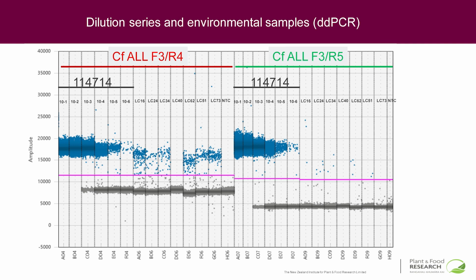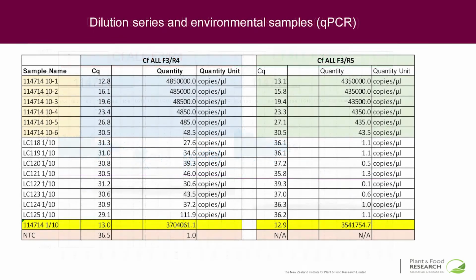But certainly on the second assay, it's good. Now, with this system, of course, we can actually quantify that. So what we're saying here is that we can see the detection levels that we can get to in terms of what these assays are, and put an actual number on that.